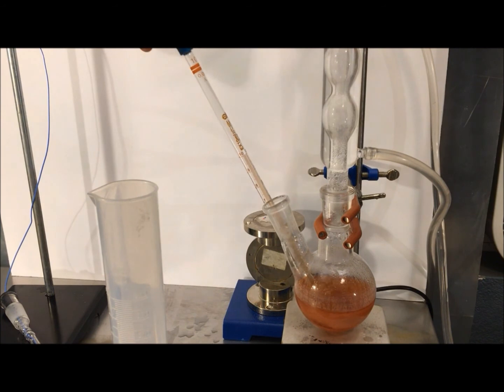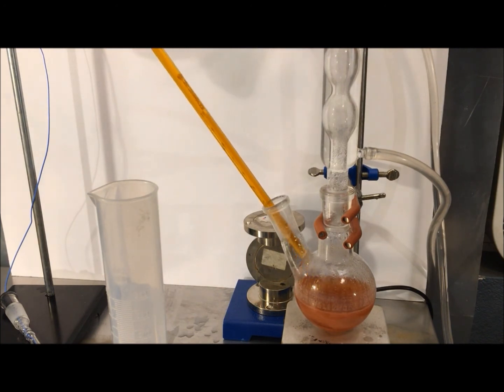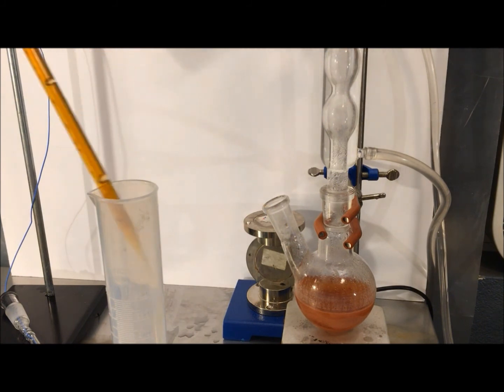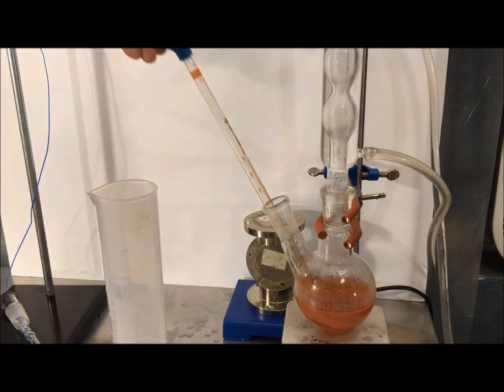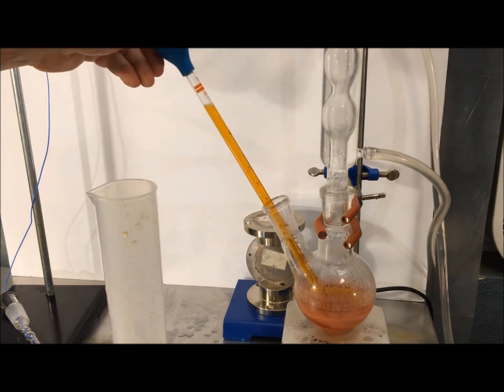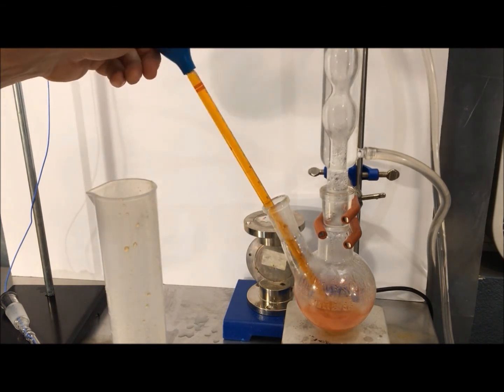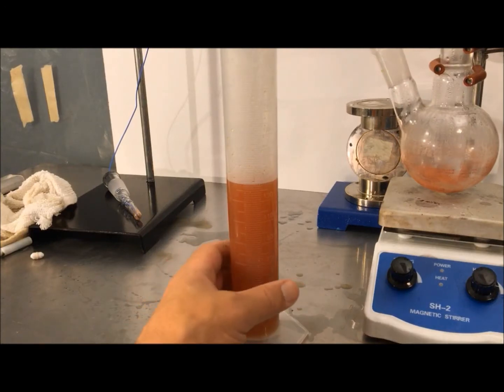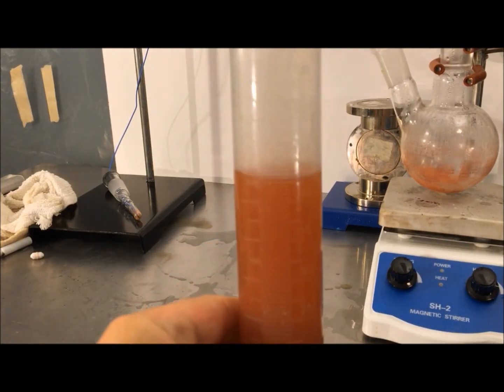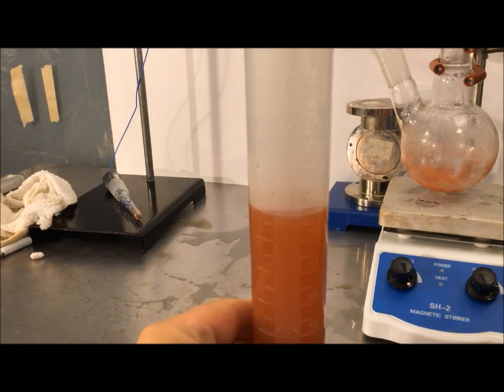This is also a good time to record your audition for those stock footage reels of people pipetting in those news segments about medical technology. Alright, let's see what we got here. About 147.